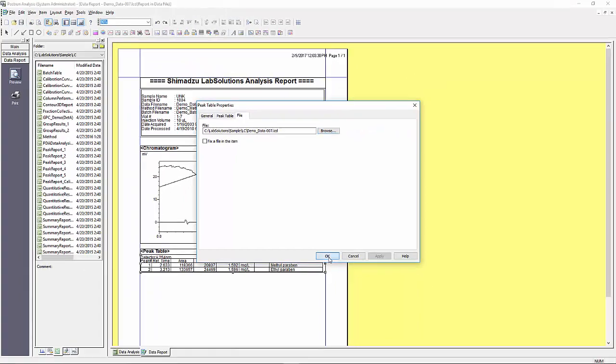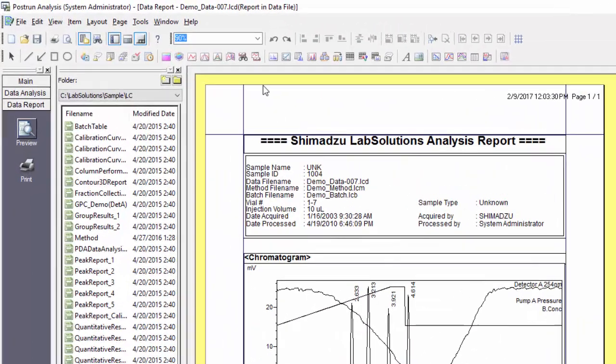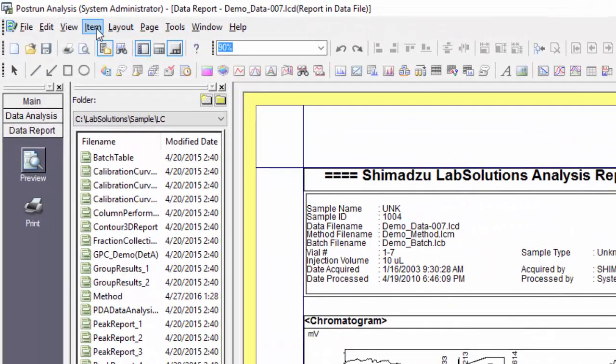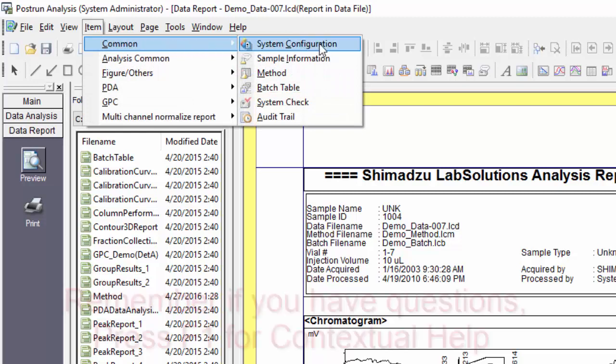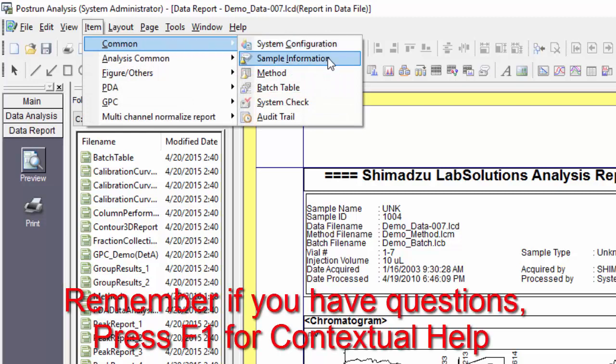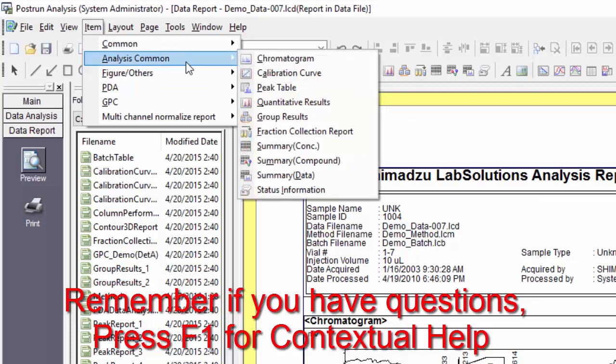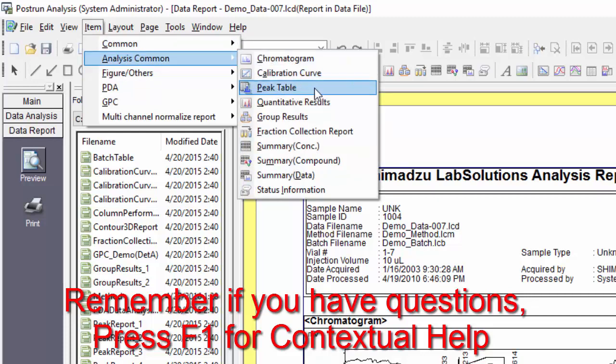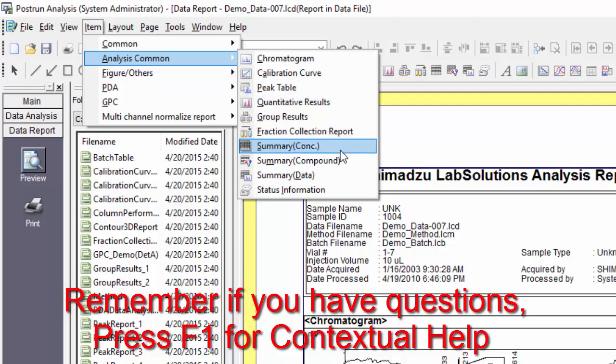So far we have been working within the predefined fields for a data report. I want to go over briefly the available item options that you have to add to any report. From the menu select items and you will see a list of the items. The column in the top of the column is broken down by type. Under common you have system configuration, sample information, method, batch table, system check, and audit trail. Under analysis common you have chromatogram, calibration curve, peak table, quantitative results, group results, fraction collection, report summary, concentration summary, compound summary data, and status information.